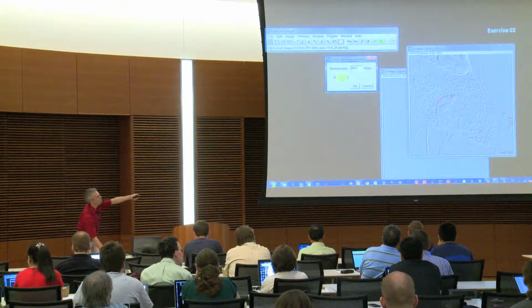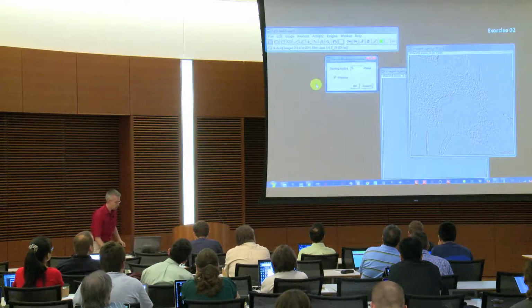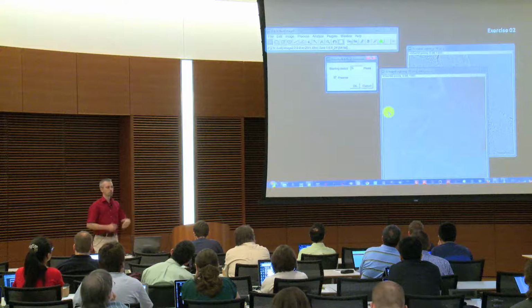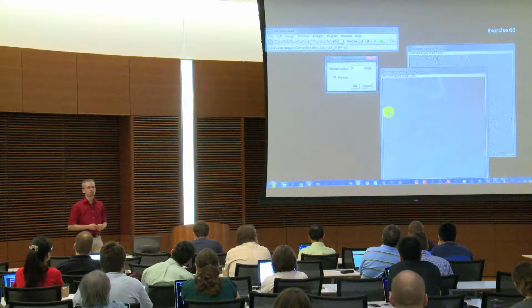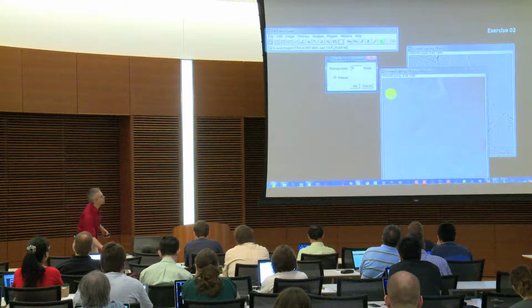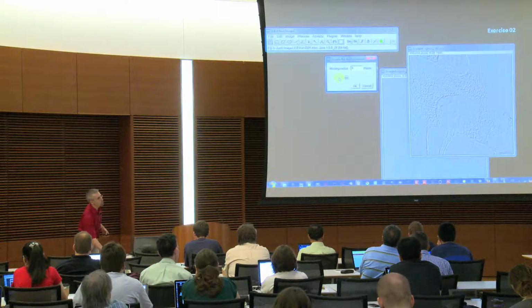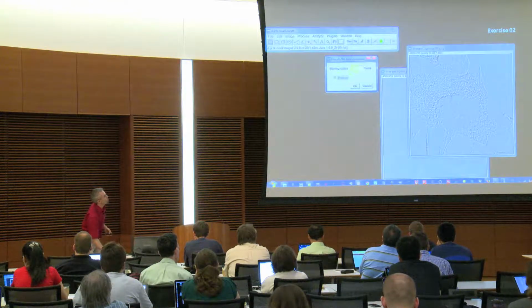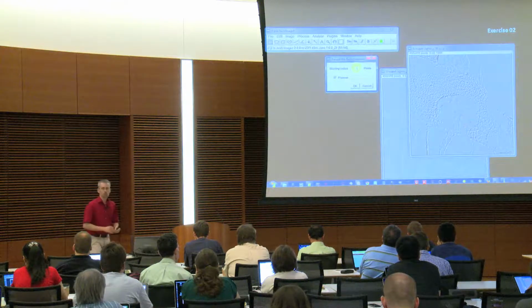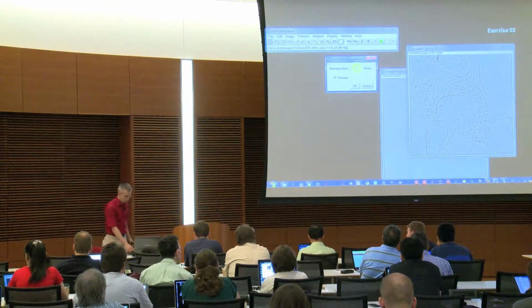Now the problem is if I use a radius here which is too small, let's say 5, then you see in my background image I still have information from my original, which is taken to divide the original by, and that obviously is counterproductive because then I destroy my image. So I need to go up here, and there is not one optimal value, there is a potential range which makes sense to use.